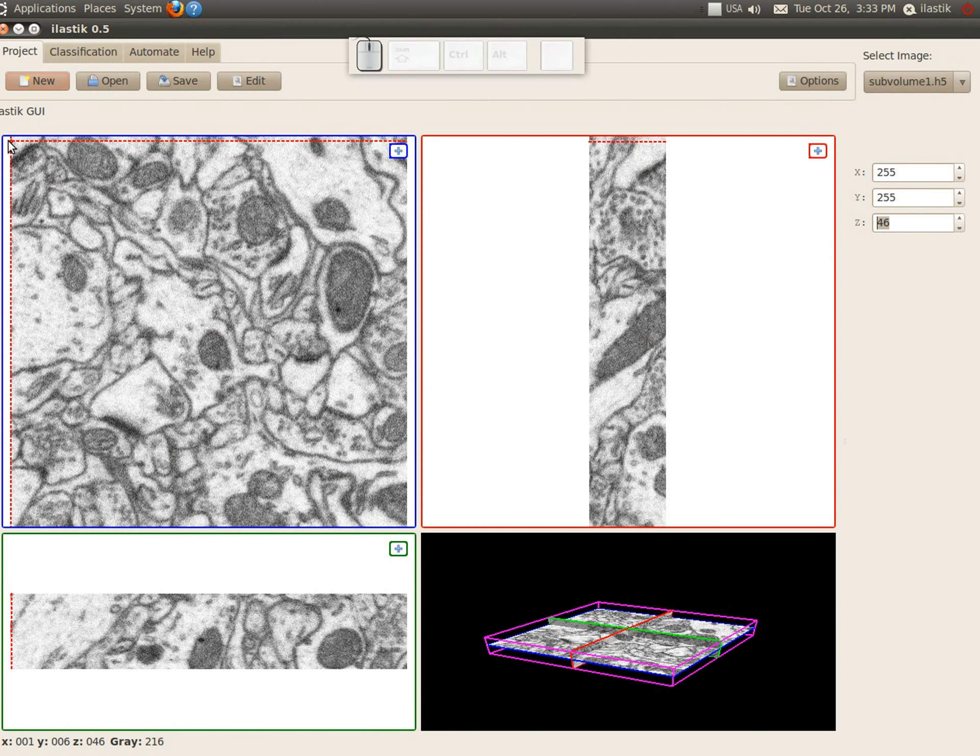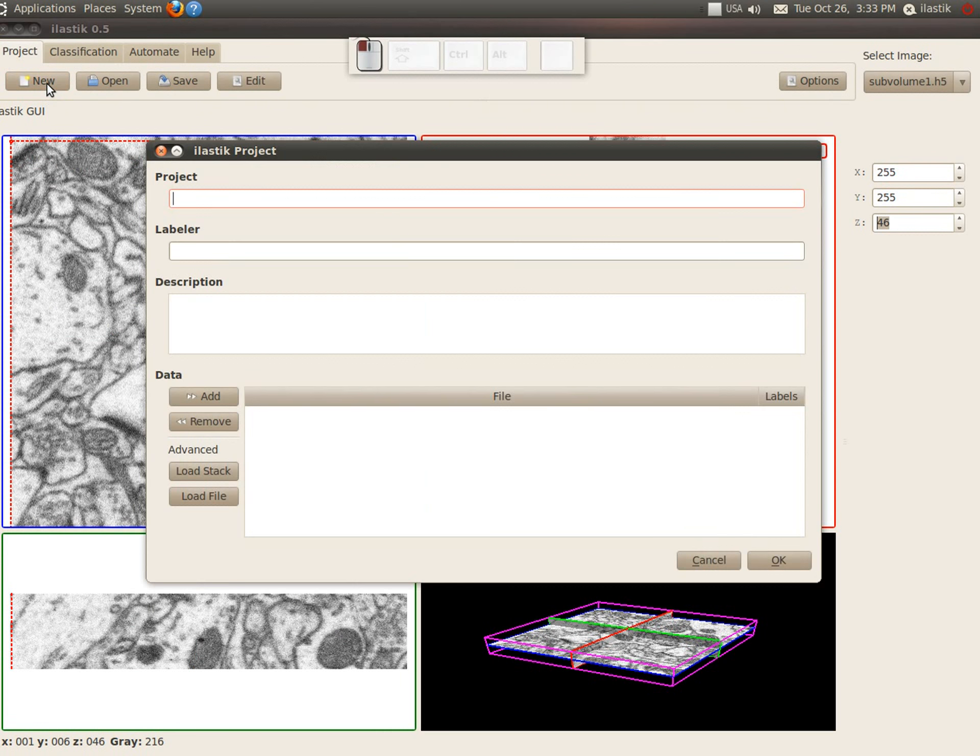Now that was loading for grayscale images. Now imagine you actually have a stack that was recorded in several channels and you want to load them all together and look at them in different colors. We have an option for that too.